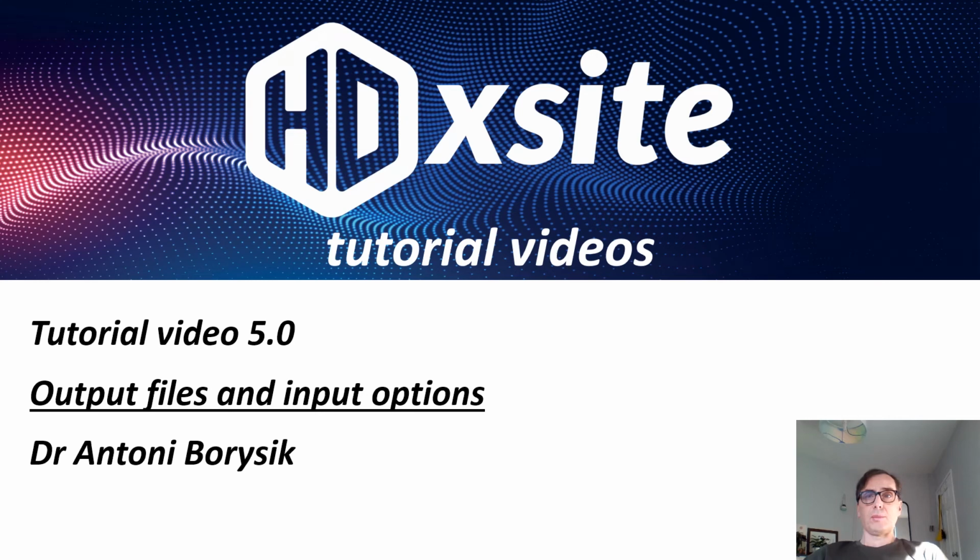Welcome to video number 5 in this series of tutorial videos for HDXmodeller. And in this video we're going to go over the output files. So these are the files that are emailed to users once the optimization is complete, and also two different input options.